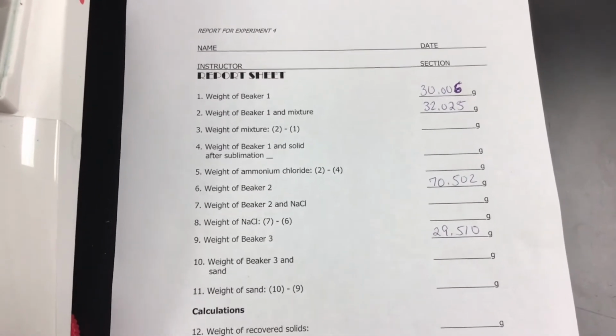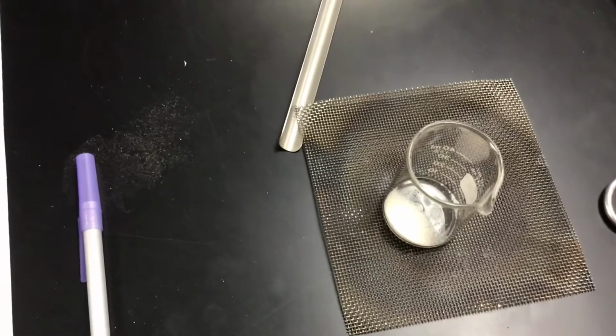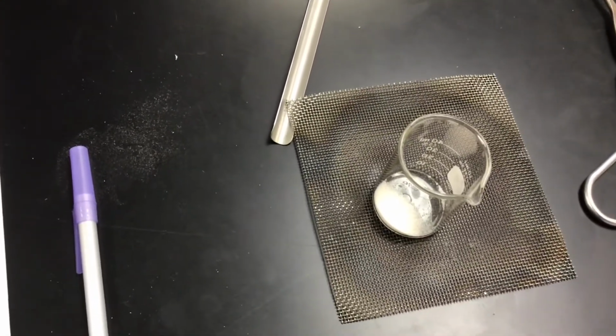Okay, again, I'm just waiting for that beaker 1 right there. It's resting, it's cooling off. Once it gets cool, I'll get the mass of that.